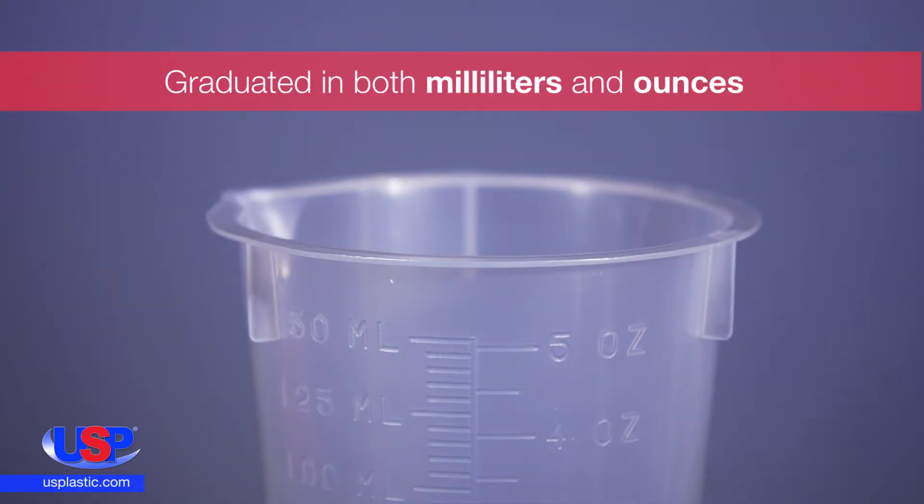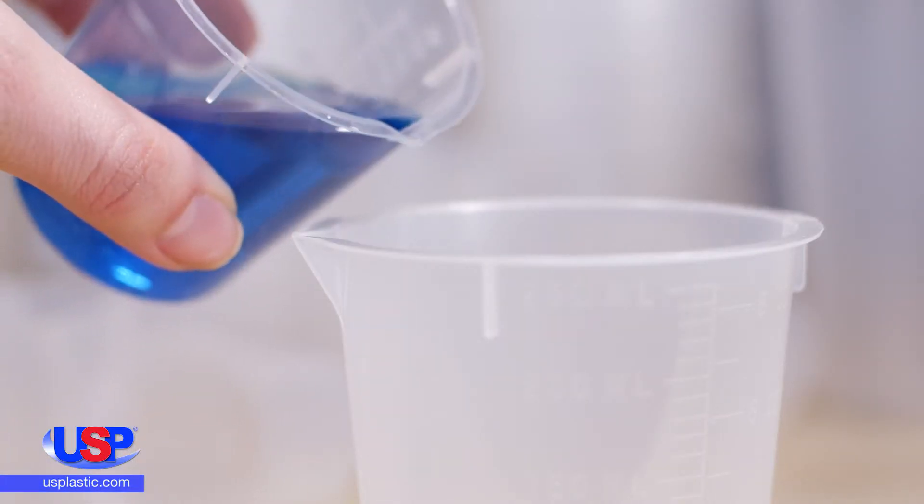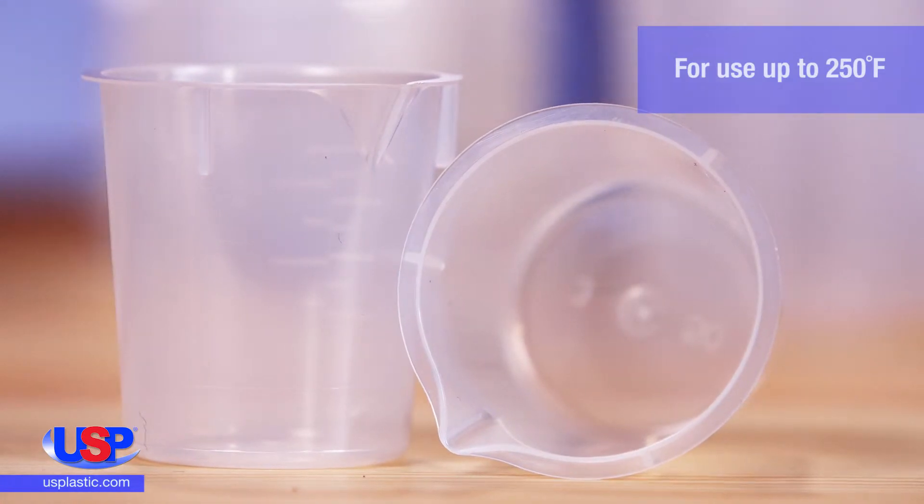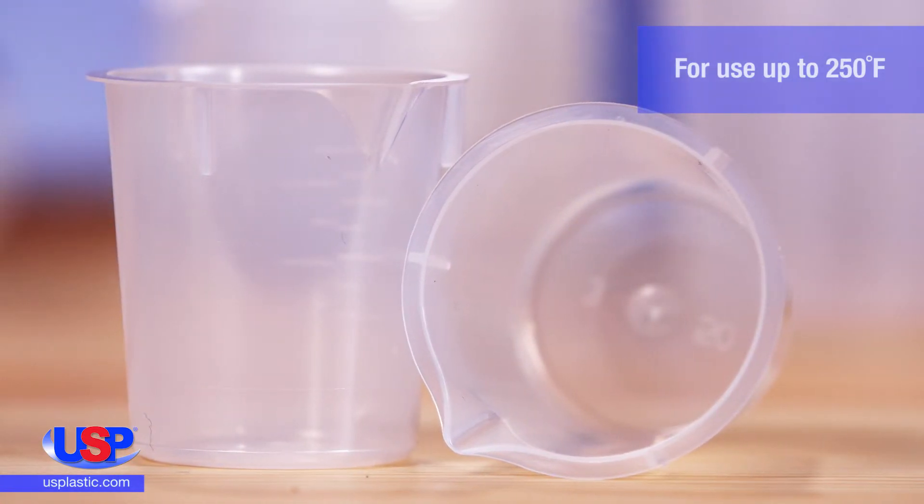Graduated in both milliliters and ounces, the translucent beakers have a dripless lip and a flat base. For use up to 250 degrees Fahrenheit, these beakers are autoclavable.